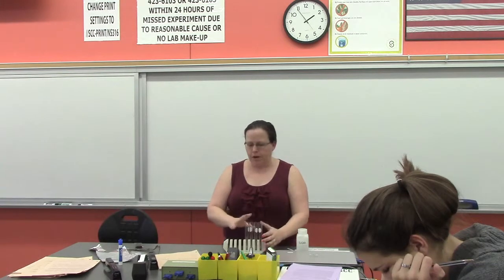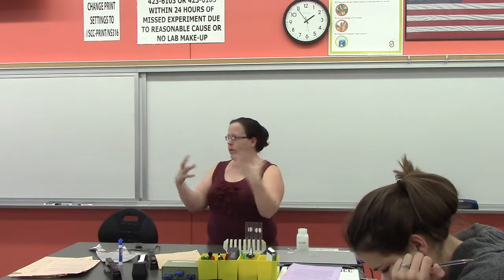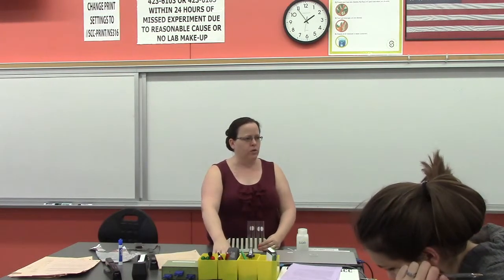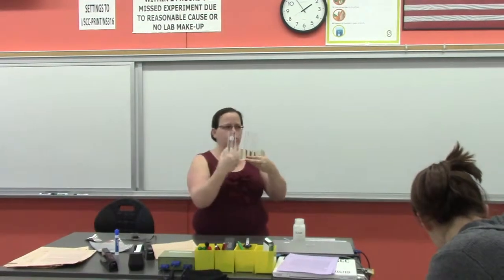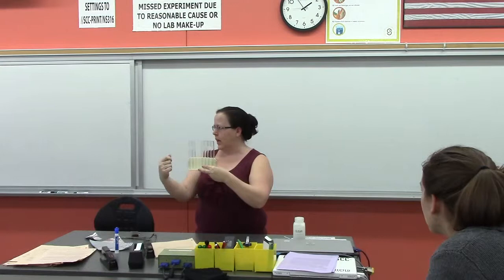So the second part, we're going to deal with miscibility, which is dissolving of liquids in one another. You're going to need 3 clean test tubes in order to do that. Well, the group that I borrowed this from, they're going to use 4 test tubes for the first test, and they only have 2 test tubes left for their second test. So they're going to have to wash dishes in between.